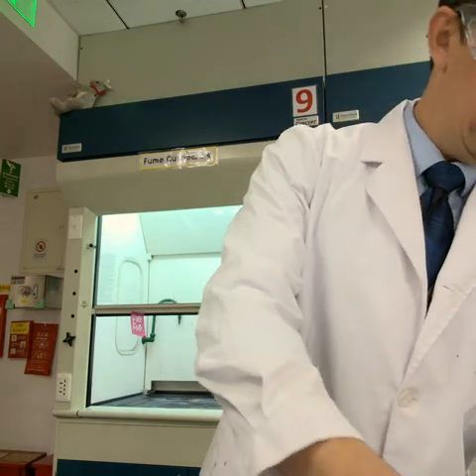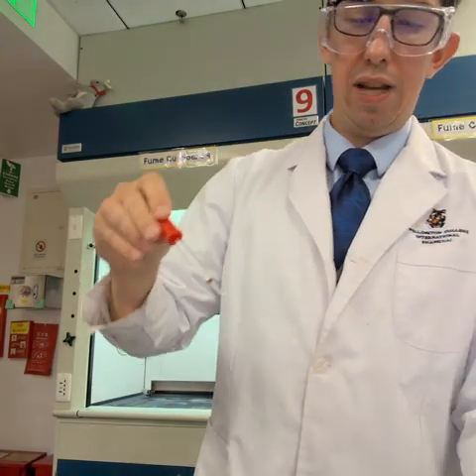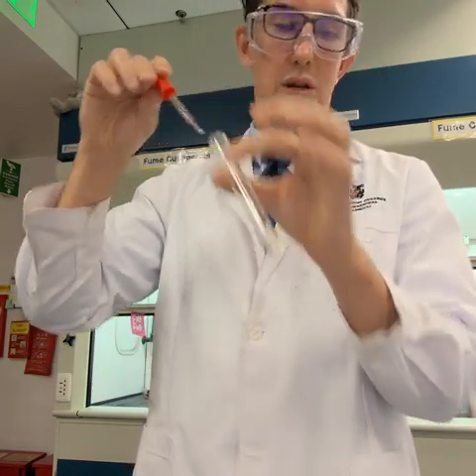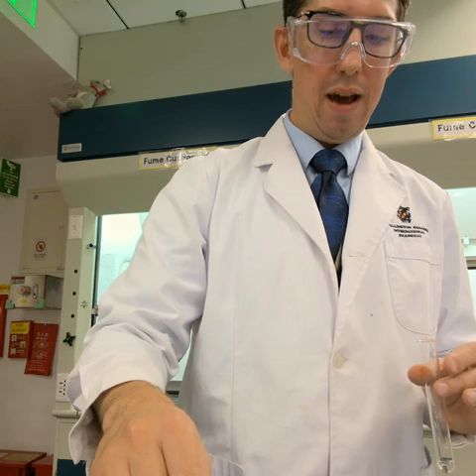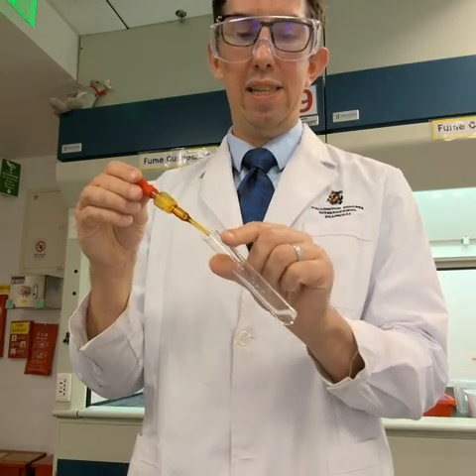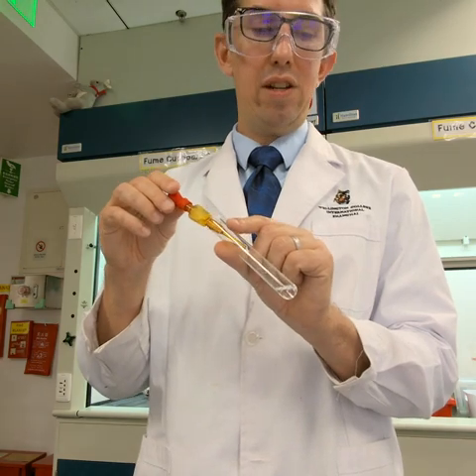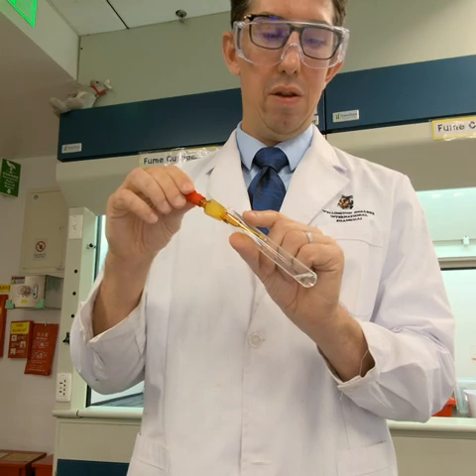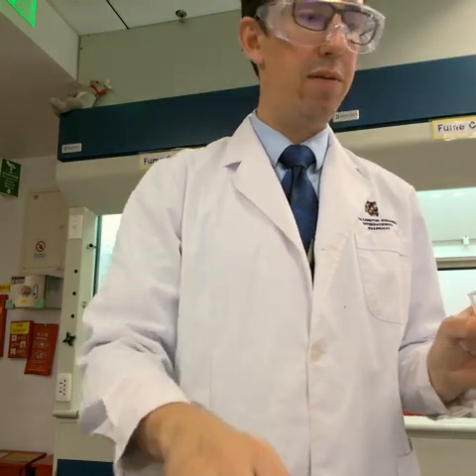All right, so to find out what halide is present in here, I'm going to take a small sample into a test tube. And then the first test reagent I'm going to add is nitric acid. Now nothing will happen really. Nitric acid is just there to remove any carbonate ions that might react with the next test reagent and also give a precipitate. So this is just going to remove any carbonate ions that might interfere with the test.